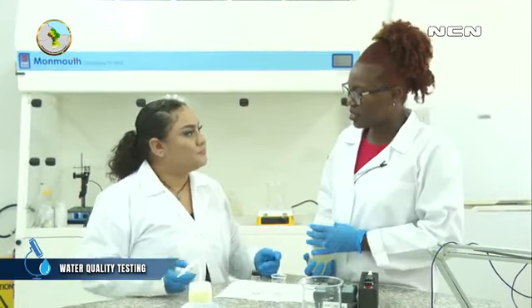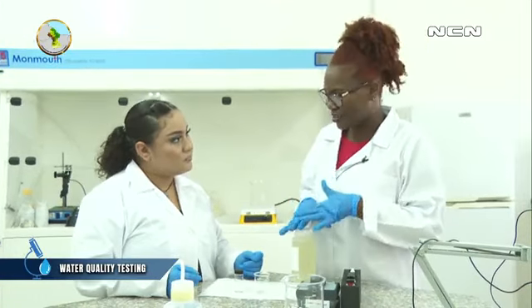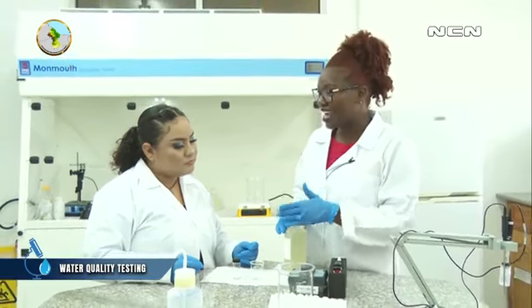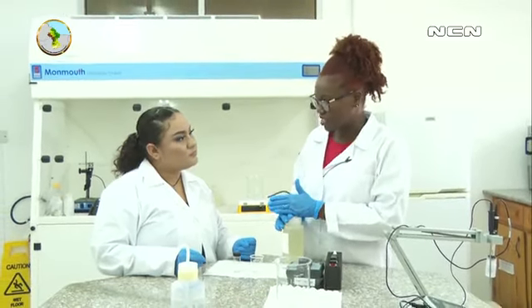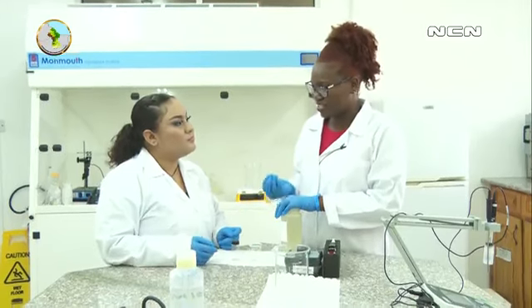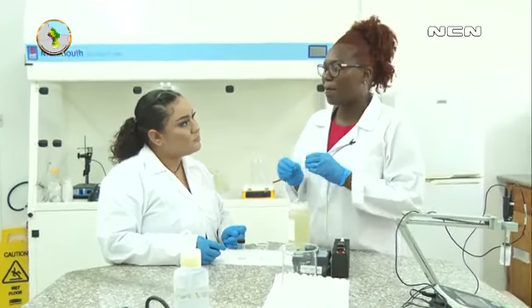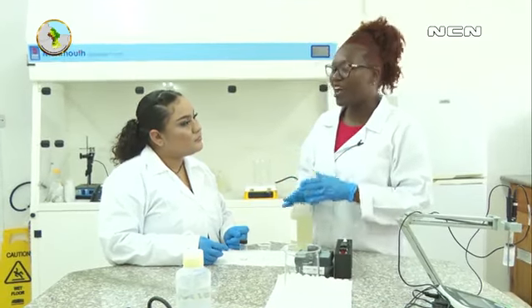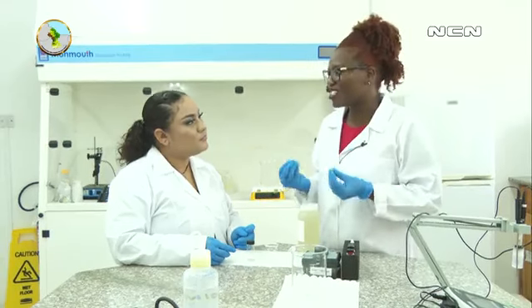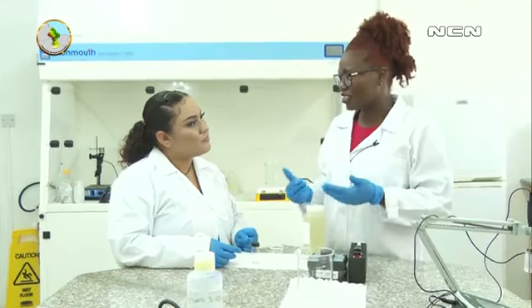Because when we talk about turbidity, we're talking about the cloudiness of the water, how the water looks, if there are any floating particles. This meter that we're using is a turbidity meter. So that uses light, and that light shines through the water sample to pick up any particles and to pick up how much cloudiness that water sample has. And when we test for turbidity, we're looking for a range from 5 NTU and below, because that's going to tell you that it's safe. It's okay for us to drink this water. Even though it might be a little cloudy, it's still okay for us to drink it.